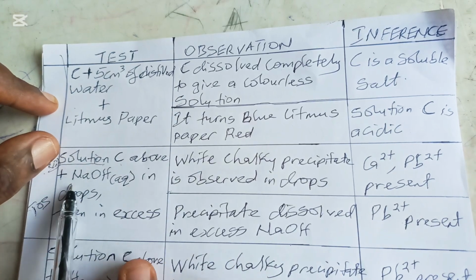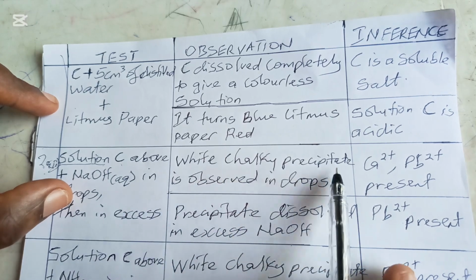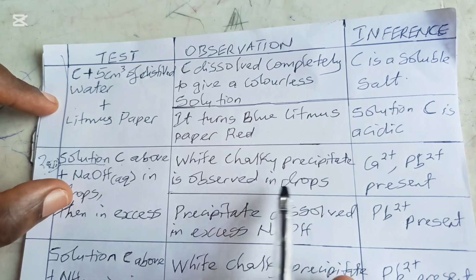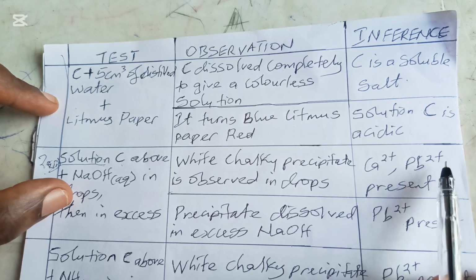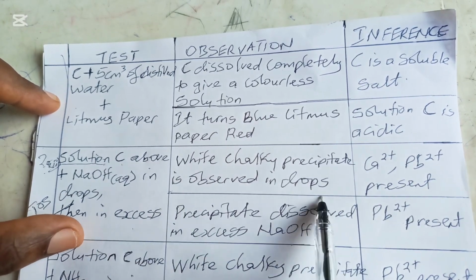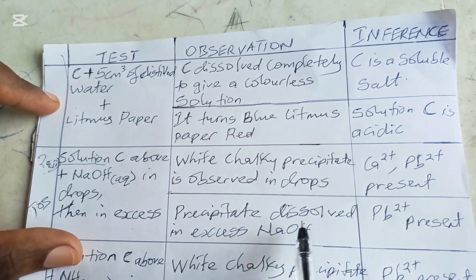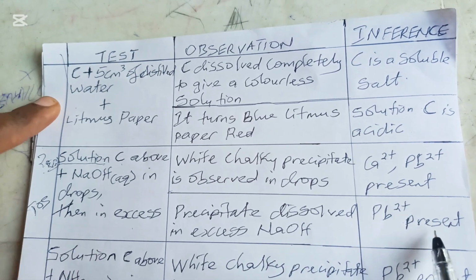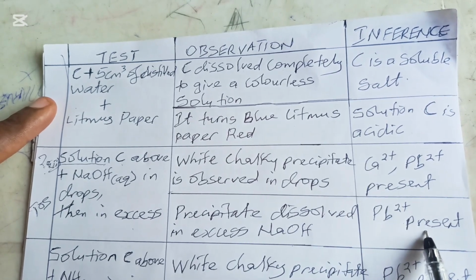Now, when you put that plus sodium hydroxide, that's your solution C, in drops, white chalky precipitate is observed. Please, after writing that, put in drops. Let us know it is in drops. So you infer that calcium or lead is present. Then in excess, after that, we now say the precipitate dissolves. In excess sodium hydroxide, it will surely dissolve. When it dissolves, it means Pb2+ is present, because that is the one that will dissolve. The calcium one will not dissolve.